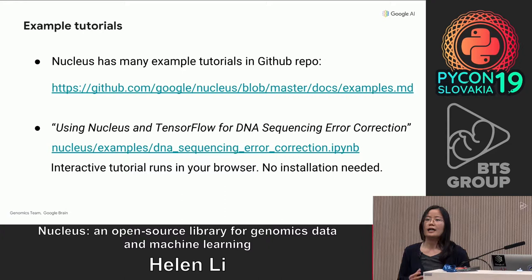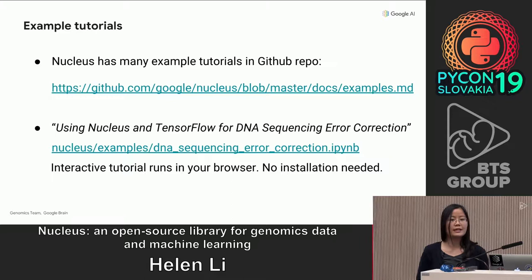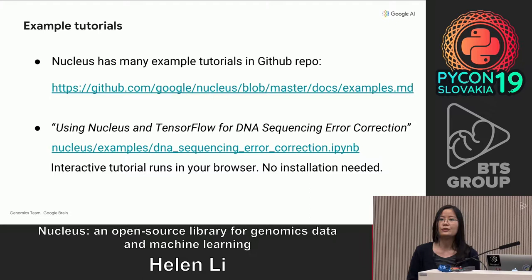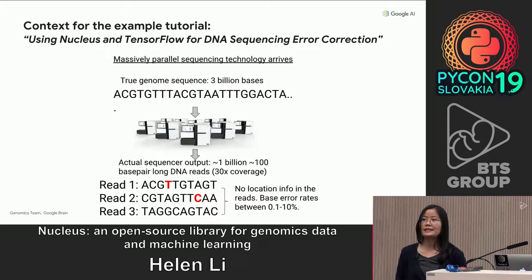Nucleus has many example tutorials bundled in its GitHub repo, and you can find them under the examples directory. Today I will go through one such example. The example is called 'Using Nucleus and TensorFlow for DNA Sequencing Error Correction.' This tutorial runs in an interactive notebook directly in your browser, and you do not need to install any software.